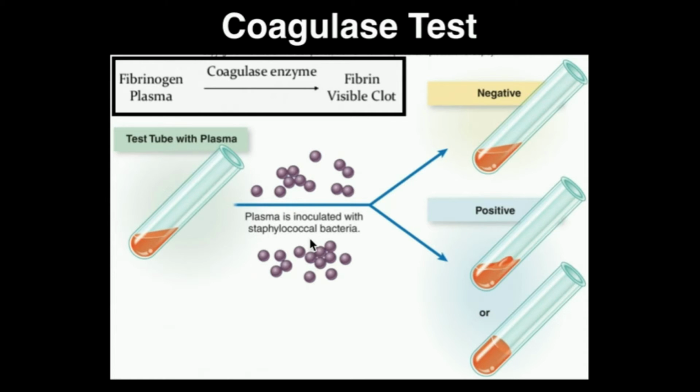Staphylococcus aureus, which is the most significant pathogen of the Staphylococcus genus, can express an enzyme called coagulase, and this can cause blood clots even without tissue injury. Coagulase, the enzyme, is actually part of how this Staphylococcus aureus propagates its pathogenic effects in vivo.